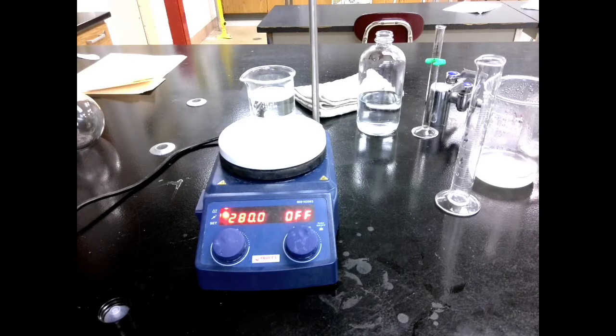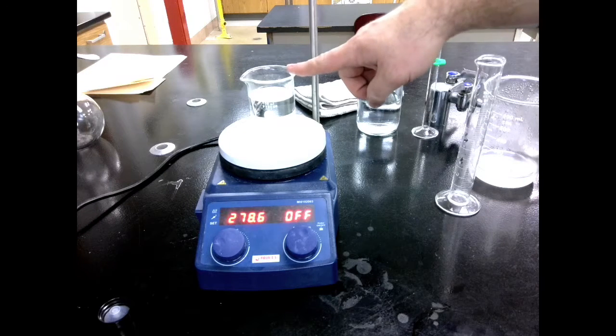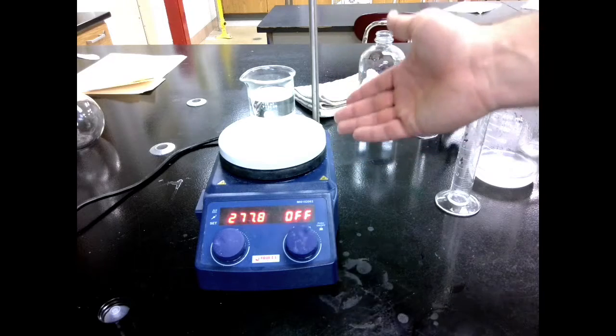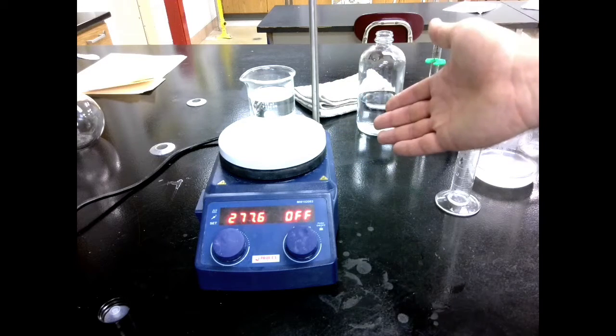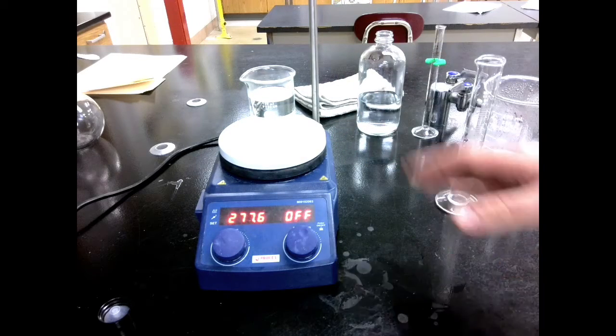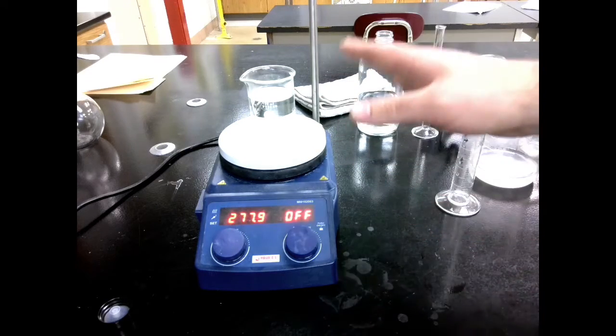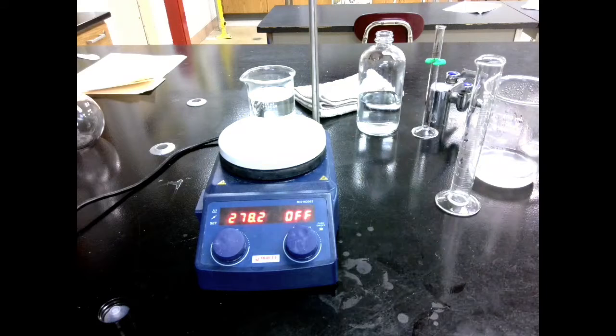For our next step, we're going to be filtering off our crude aspirin. But in the step after that, we're going to need some boiling hot water. So before we do our filtering step, let's set up some distilled water in a 150 milliliter beaker. This is probably about 100 milliliters of water. I'm only going to need 60, but just get this boiling. You don't need an exact amount yet. So we're going to let this come to a boil while we are filtering off our aspirin.